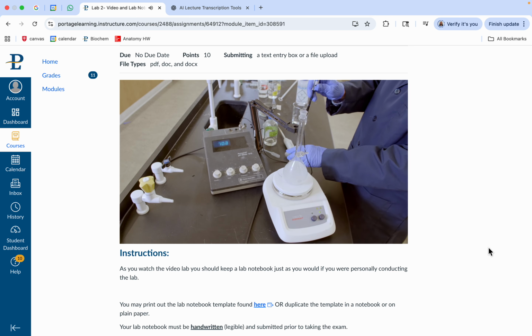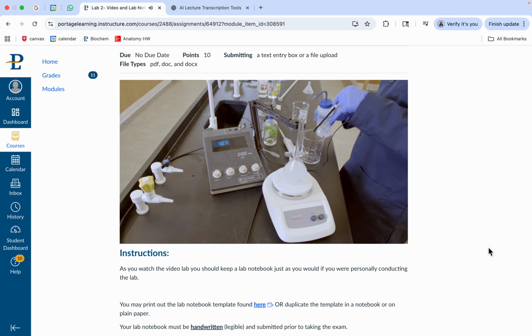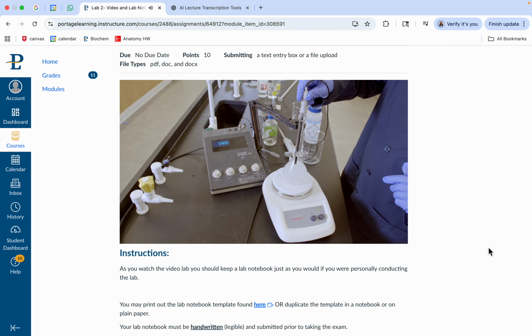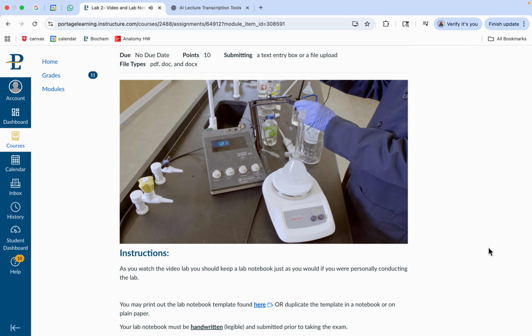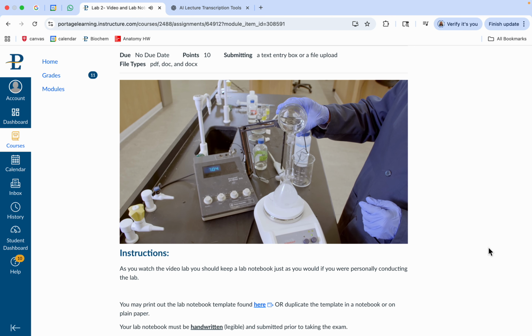All right, so I think that was going a little too fast, and the magnet got off kilter. But we're going to use our pH probe. Adjusted it. And again, this is a pencil thin one, so it fits down into the neck of it, but it only goes so far. Notice it doesn't quite now hit the top of the liquid. So we're going to add just a little bit more liquid, and again, we always want to leave room so that we can add acid or base if we need to. It's not exactly pH of 7, and it'll almost surely not be pH of 7.